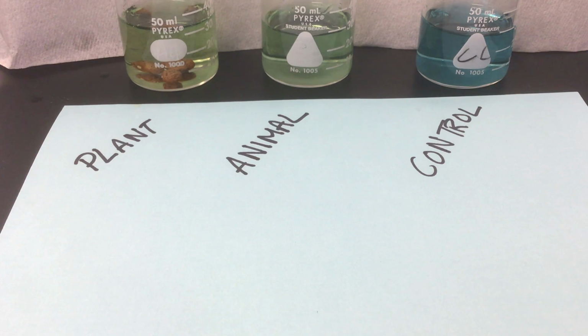It looks like we went from blue to a yellowish green color in the plant, blue to a yellowish green in the animal. And that does indicate the presence of carbon dioxide. So we must have CO2 in both of those beakers. So based on that data, you're going to want to look at some analysis questions and see what you can do with those. Remember that BTB stands for bromothymol blue, an indicator for the presence of carbon dioxide.